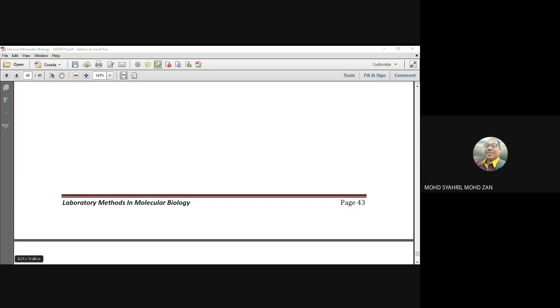Okay, untuk strand tu, saya kata tadi strand awak boleh pilih semua jenis bakteria. Buka NCBI dan terus check bakteria apa. Dengan syarat awak kena check the sequence is between 1 million maximum or minimum 15,000. So untuk awak nak check strand dekat mana, awak check balik video ni dekat mana awak nak tahu nombor dia. Nombor tu bilangan dia ada dekat bawah dekat tulis tu base pair. Bakteria boleh pilih bakteria apa pun. Jangan pakai bakteria yang dicadangkan dalam protokol ni.